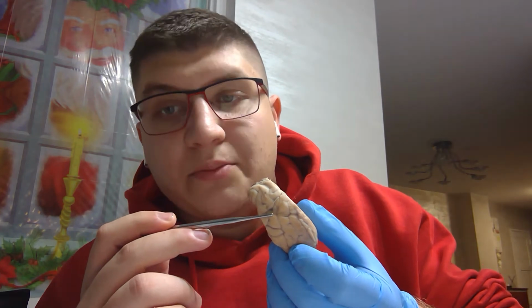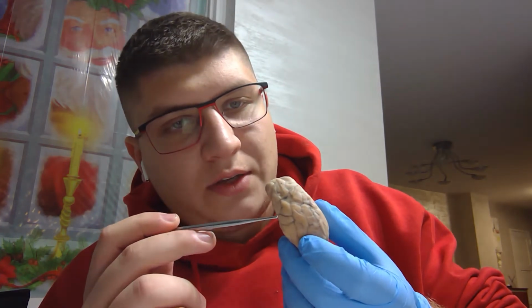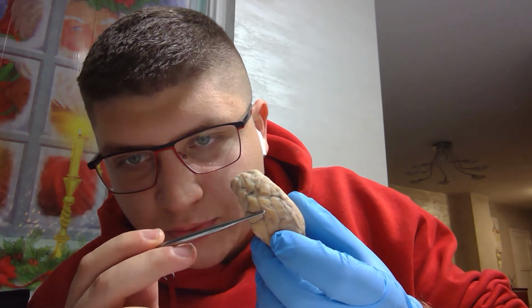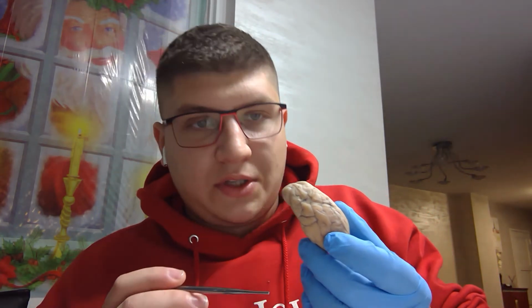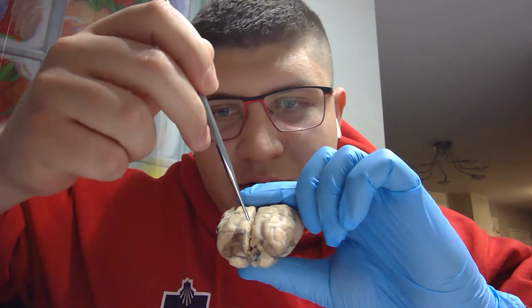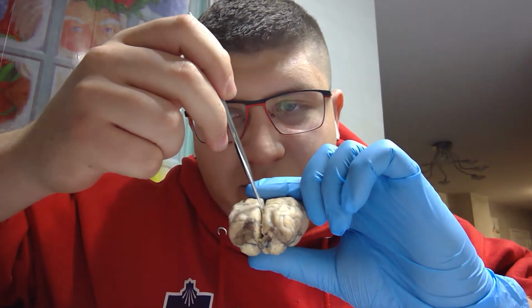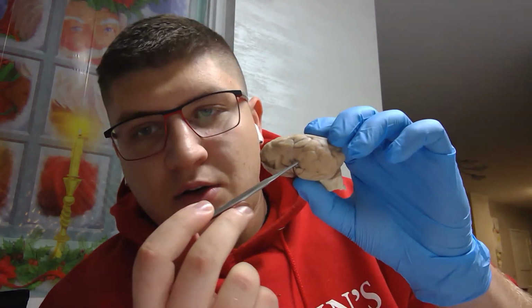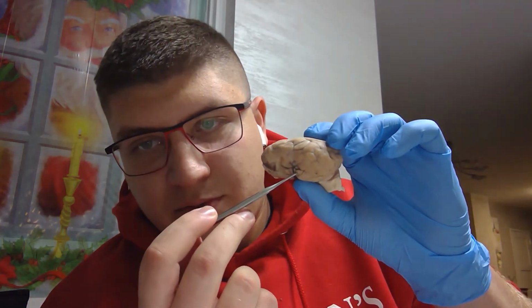Those are going to be like your bumps. That's your gyri. If you look further in, like your grooves and the indentations, like right there, those are your sulci. One of the fissures on the brain, the longitudinal fissure, I cut right down. Just imagine the two halves, which I have right here. That right there is your longitudinal fissure. If you go along the side, right there is your lateral fissure.